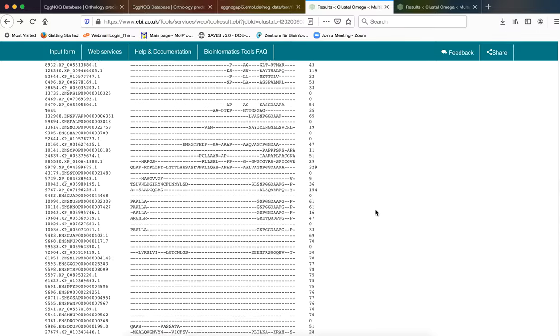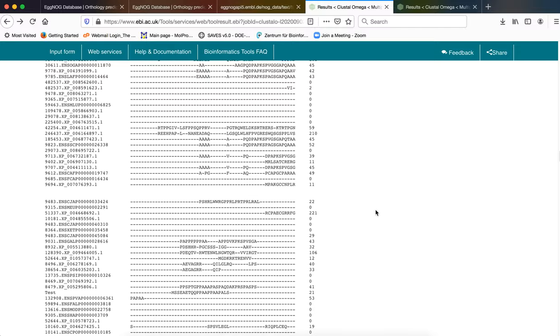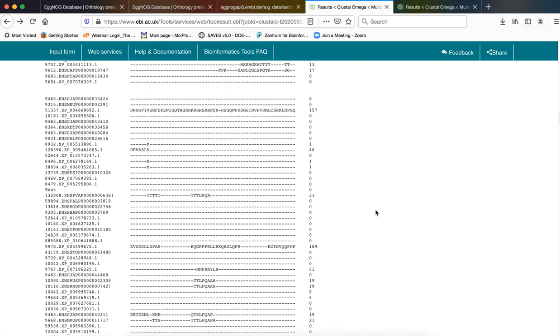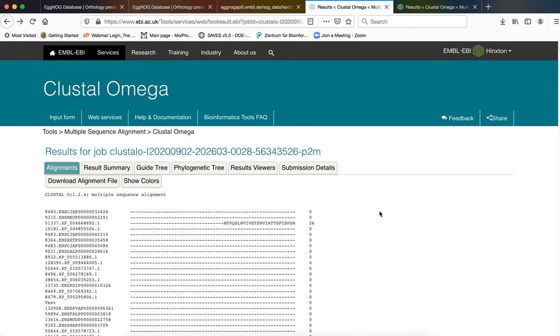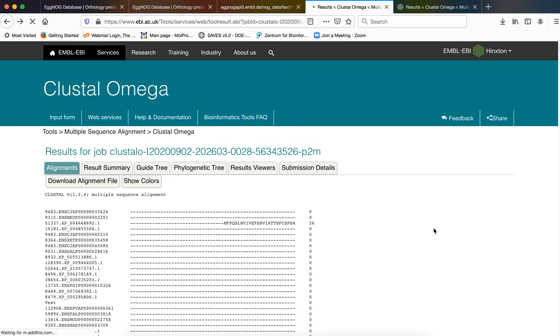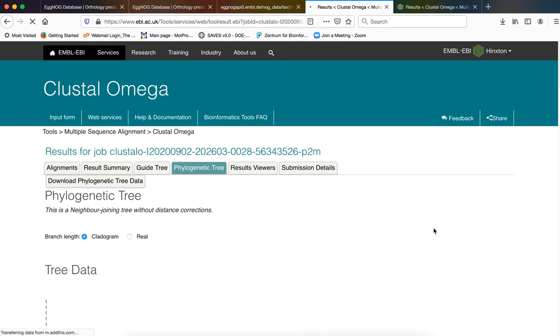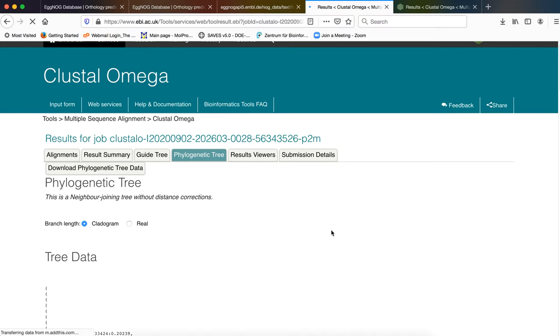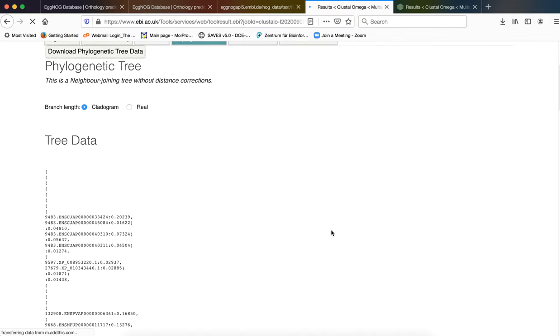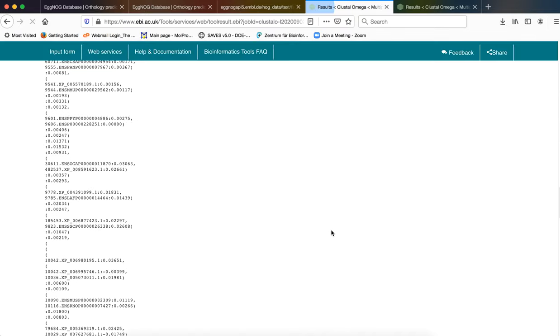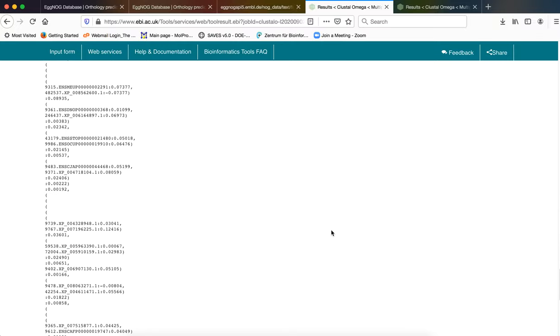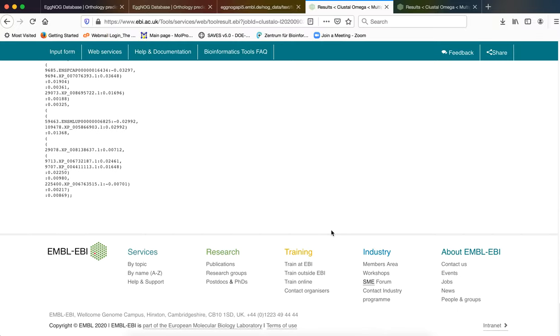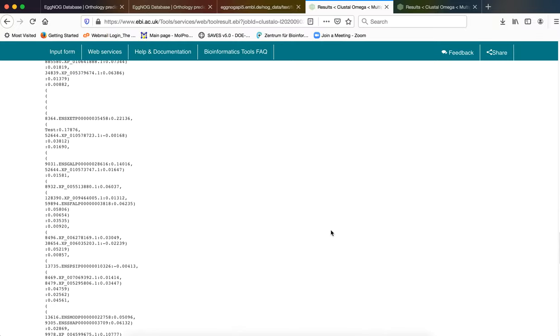And then if we go upwards again and click on phylogenetic tree, we will find a tree data that is being generated in the form of a Newick format.